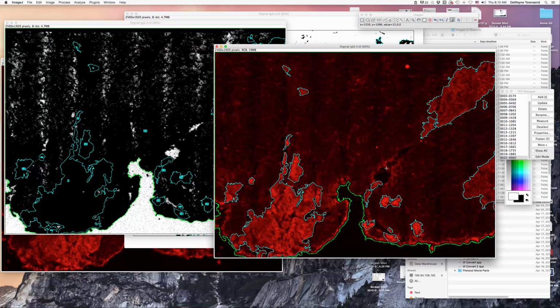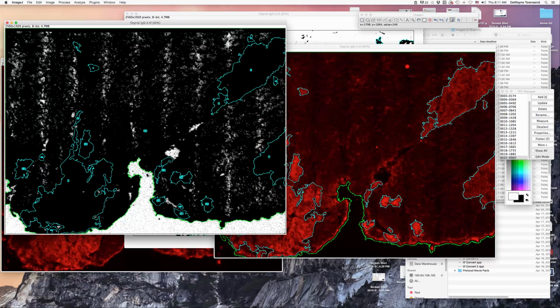Now one thing you'll notice is that there's an area in here that's sort of a hole in the tissue that we might be inclined to exclude as part of counting the total muscle area. And so in order to do that, we have to identify another ROI. So it's a little tricky to do automatically. Generally, there are very few of these areas, so it's often easier just to do freehand on these one or two little sections. And so the freehand tool is this guy right here.